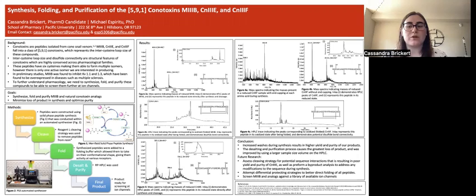These confirm that we have created our intended peptide by the confirmation of expected masses that the peptides would have when sent through a mass spectrometer. Accompanying those mass spectra are the results of our HPLC traces. I have also provided sequences. For example, you can see in the figure 2A inlay that shows how our peptide would look after synthesis, as long as everything has gone to plan. It is in its reduced state.